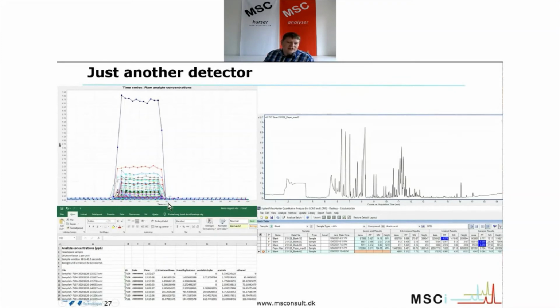Then had an injection for 30 seconds, and then had it measuring up to 100 seconds, just to have some background values as well. Here, we have a time scale of more than 19 minutes. So this analysis took less than 2 minutes. This took 20 minutes.